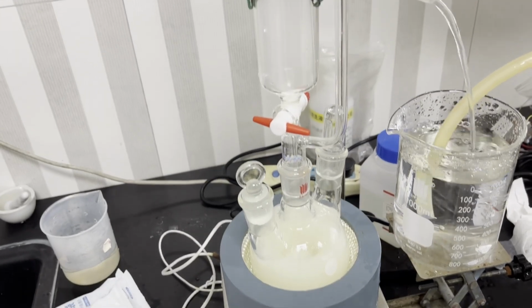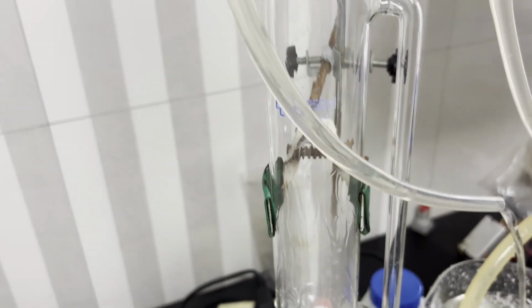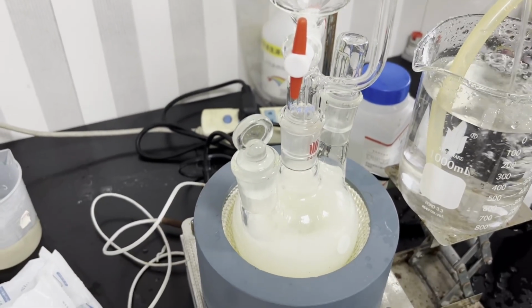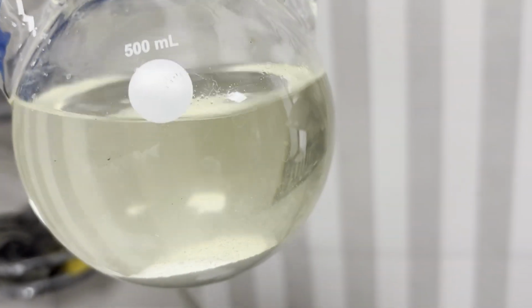After all nitrite is added, the heating is turned on to bring the mixture to reflux for around 10 minutes, which is said to improve the yield by a few percent. Even at reflux, the content in the flask is still cloudy due to the limited solubility of potassium azide in the ethanol-butanol mixture. As soon as the stirring is turned off and the boiling stops, all of the azide settles to the bottom as small white crystals.